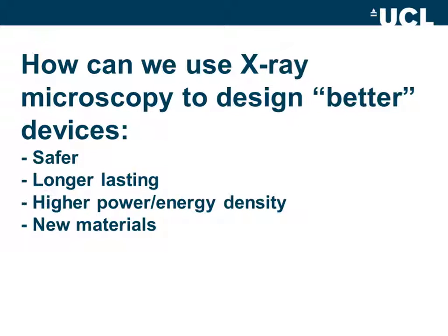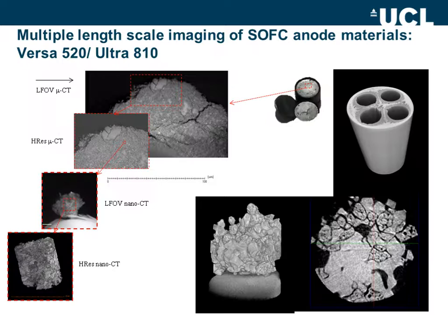So we need to take those existing material sets and indeed new material sets and use the X-ray microscopy and correlative microscopy tools in order to engineer the best possible device for a very broad range of very demanding applications.